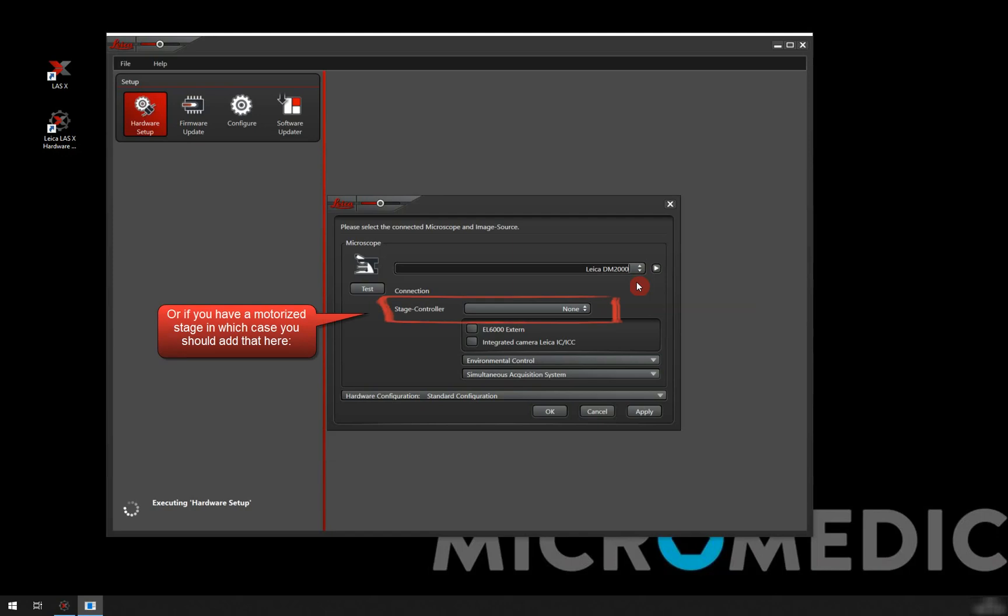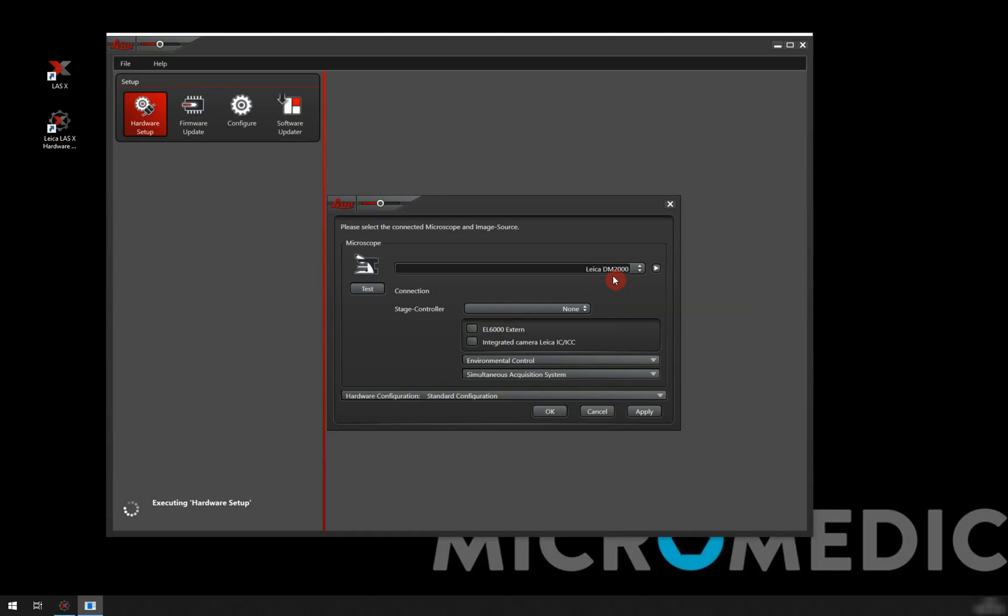Leica has a few cameras that you can integrate into the light path of the microscope. For example, the ICC50W is one very popular together with the upright microscopes here. So if you have that, then you would need to tick this box. But if you don't, then you leave that and we are ready to move on.